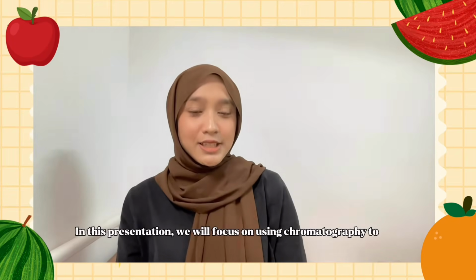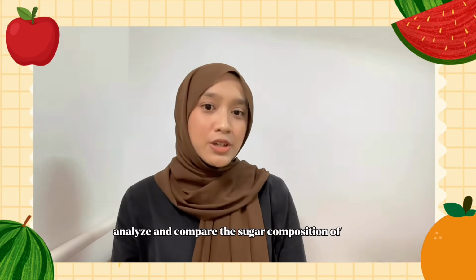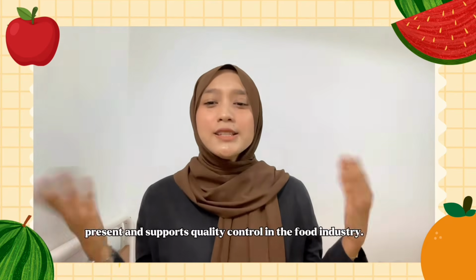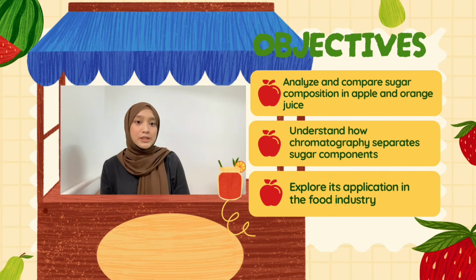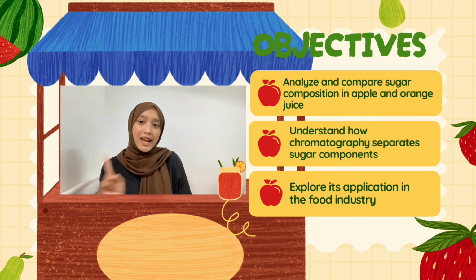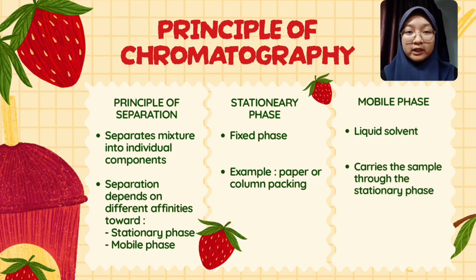In this presentation, we will focus on using chromatography to analyze and compare the sugar composition of apple juice and orange juice. This helps identify the different sugars present and supports quality control in the food industry. The objectives of our presentation are to analyze and compare the sugar composition of apple and orange juice, understand how chromatography separates sugar components, and explore its application in the food industry. Thank you. Now, I will explain about the principle of chromatography.